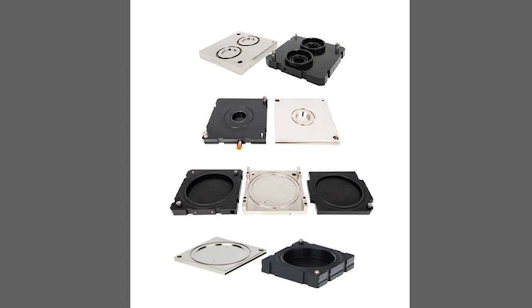Then it's a computer-driven system. If you've got constant tests that you're always doing, you just hit start. You put in some details about your material type, some ID. You'll control temperature, so you'll have to put in what temperature you want, what humidities you want, and the like. It's really nice. We have other cells sometimes for more customized tests.